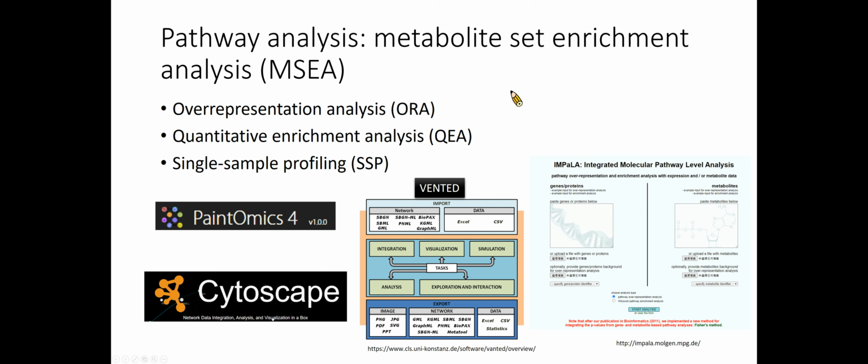To date, three different approaches have been developed to perform MSEA, including the overrepresentation analysis (ORA), quantitative enrichment analysis (QEA), and single sample profiling (SSP).